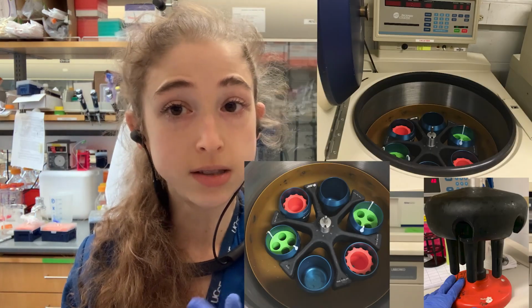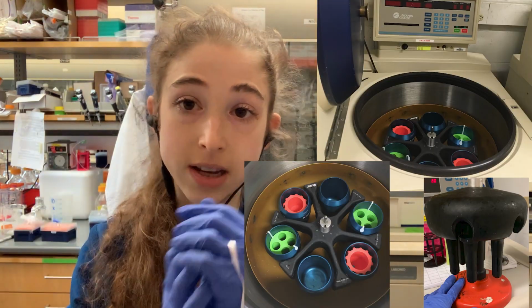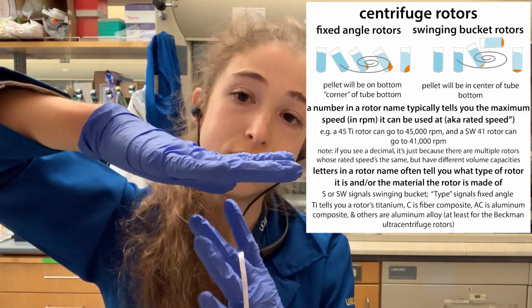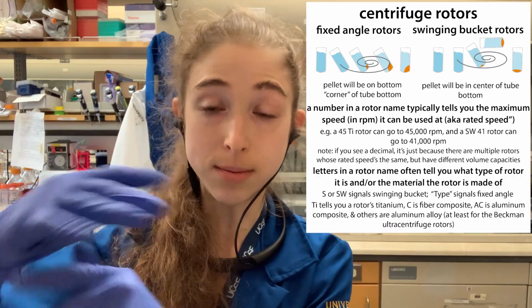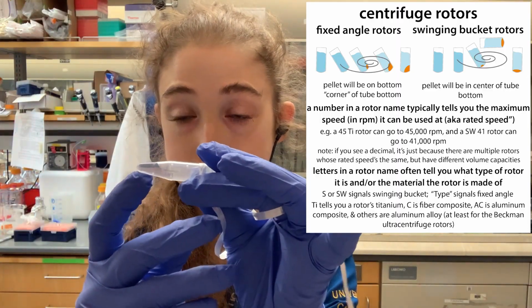There's swinging bucket, where there are actually buckets that the tubes are held in. With one of these, it's like one of those jellyfish rides, where as it goes, the tube starts going up to the point. And so when you pellet things, the pellet is going to be collected at the bottom of the tube. If this was a swinging bucket, it would be right here.